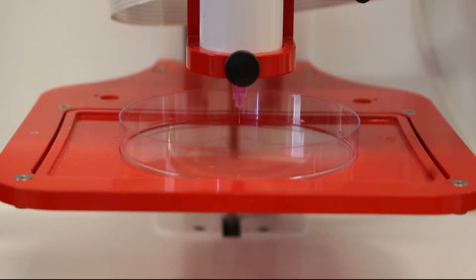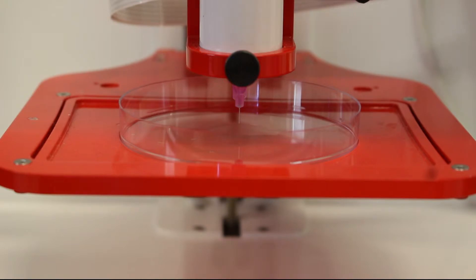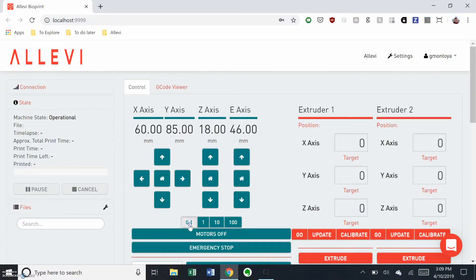Switch the step increment to 1 mm and bring it higher as you get closer. Switch to 0.1 mm when you're very close.